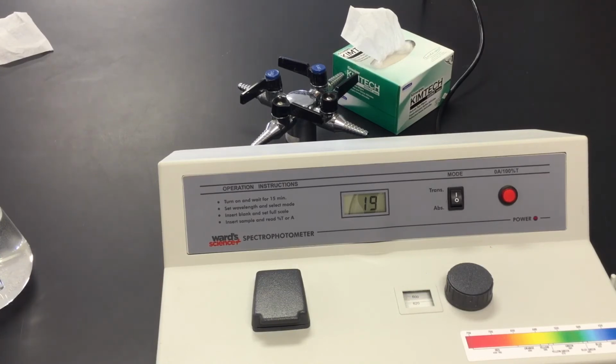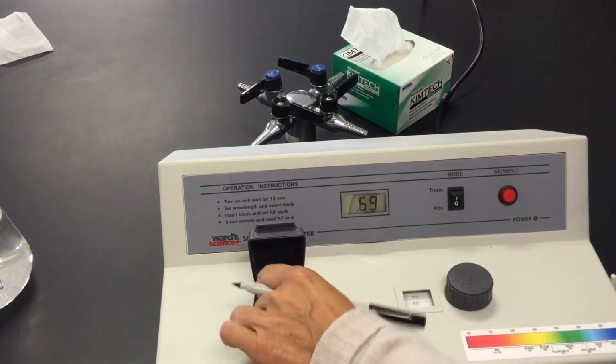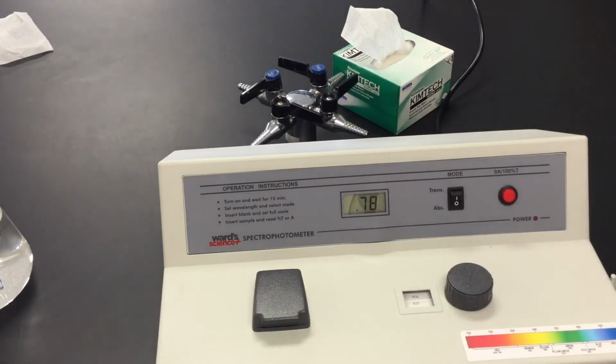And I'm now down to my 11th tube. My 11th tube is straight copper sulfate. I'm switching that back to absorption. Copper sulfate's going in. My absorption is 0.78. My transmittance is 16%.